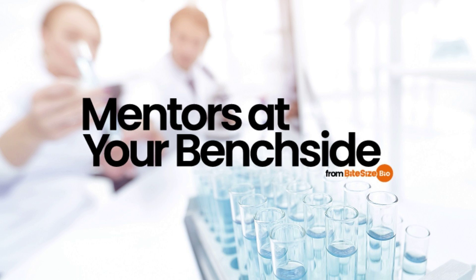Another method is looking at dissolved oxygen and carbon dioxide. Consider beer made from yeast, or kombucha made from yeast and various bacteria, and other enjoyable beverages fermented by microbes. As the fermentation progresses in these examples, oxygen is consumed and carbon dioxide is formed. The same process happens in an aerobically growing bacterial culture. Dissolved oxygen and carbon dioxide probes are commonly used in bioreactors. If you want a less invasive option, you can get optical sensors and patches that use LED fluorescence to monitor dissolved O2 from outside a flask.